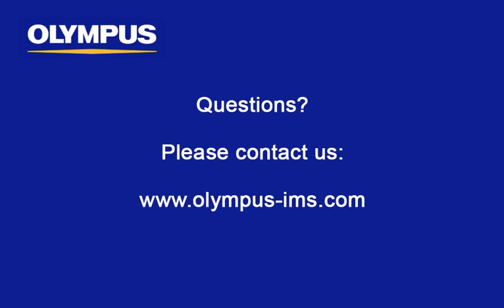In this instructional video, we have covered page template creation within the Olympus Stream Image Analysis software program. We hope this video has been beneficial and we invite you to contact us directly with any questions.